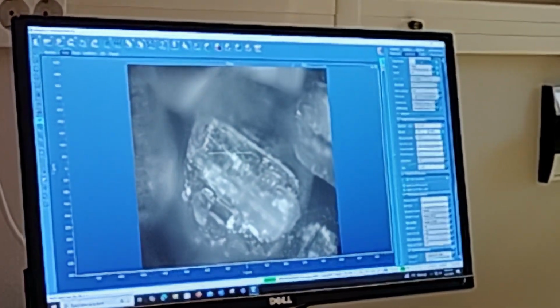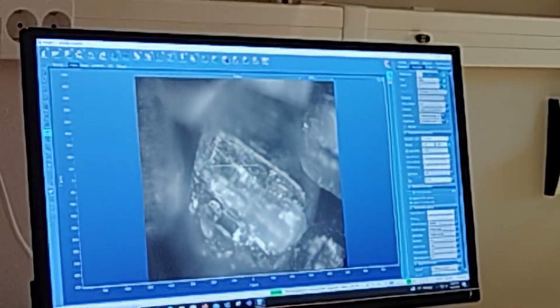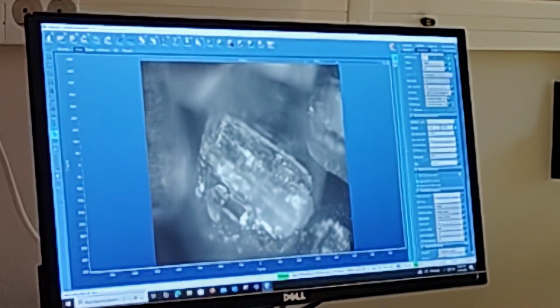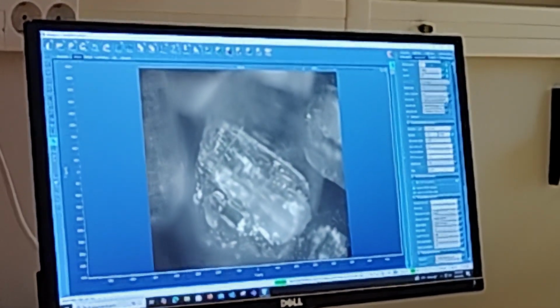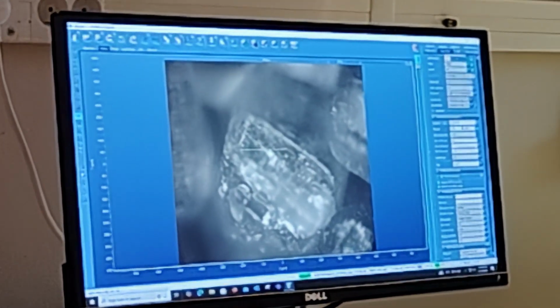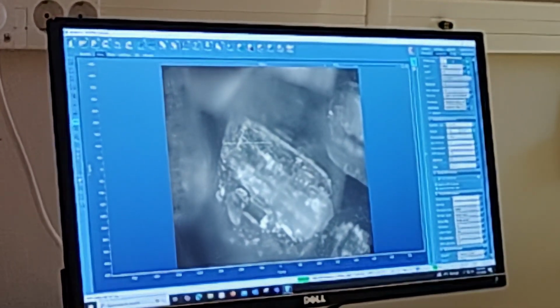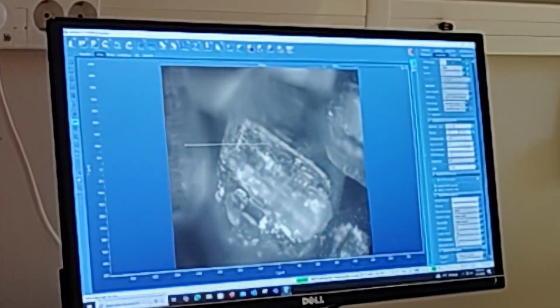So let's say we want to take the data points not horizontally, perhaps. If you want it diagonal, you can choose such a tool as well, if you want to scan in another direction. But yeah, you can just keep it like that, straight on. And let's make it so it goes over that hole there also.